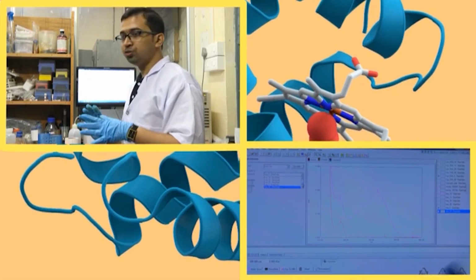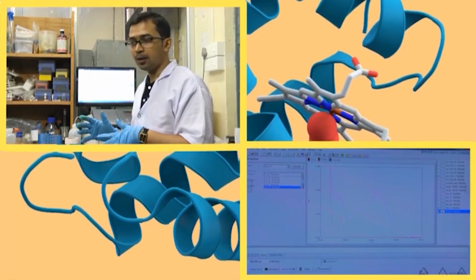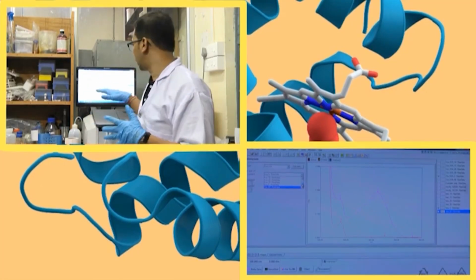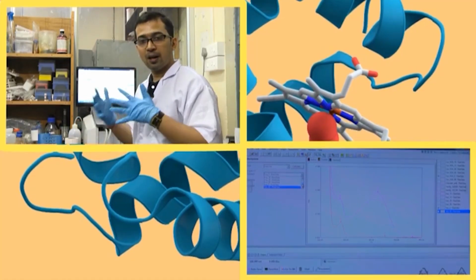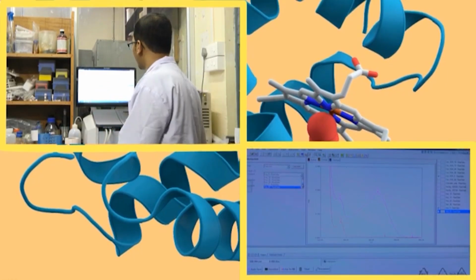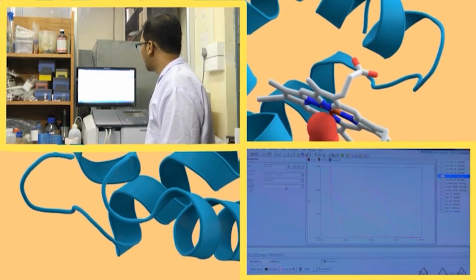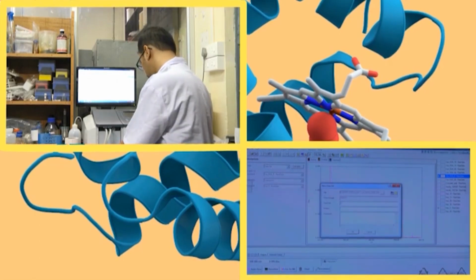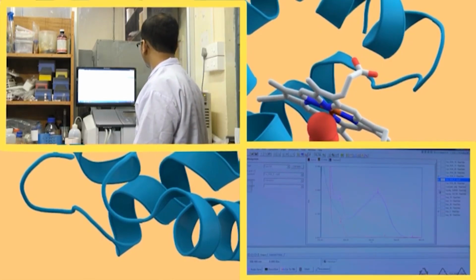Suppose your instrument does not provide this facility. What conventional people do is take the text file for curcumin plus HSA 5 microliter, and the text file for HSA 5 microliter, plot them in Excel, and subtract in the normal way. Here we take curcumin HSA 5 and subtract it from the HSA 5 value. We are just giving a random name, sub 5, and this is the value for sub 5.